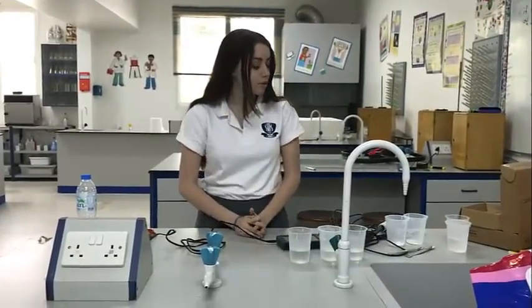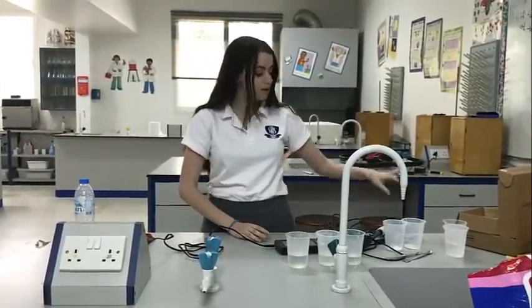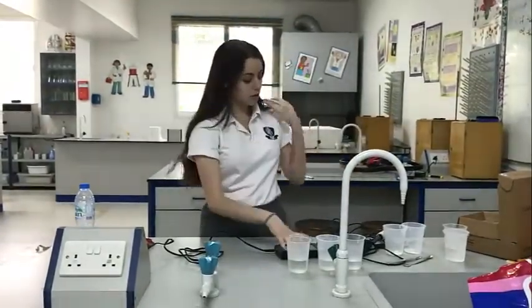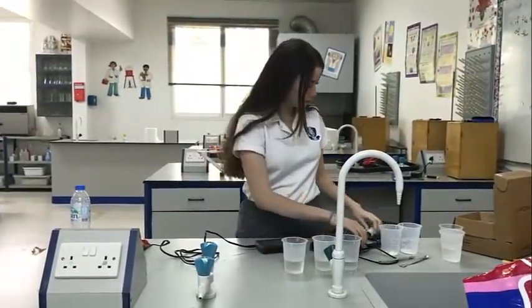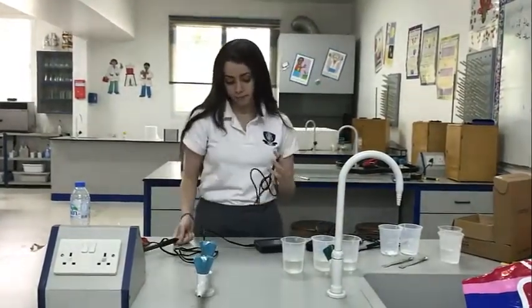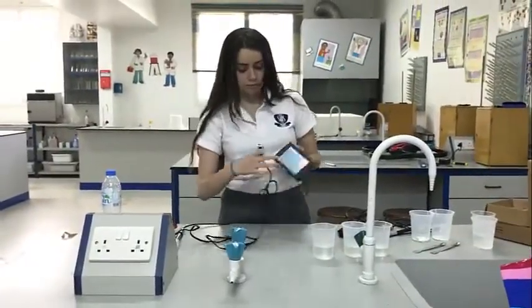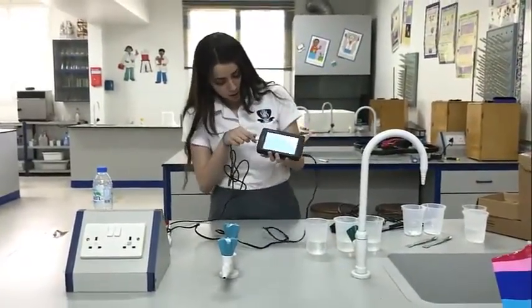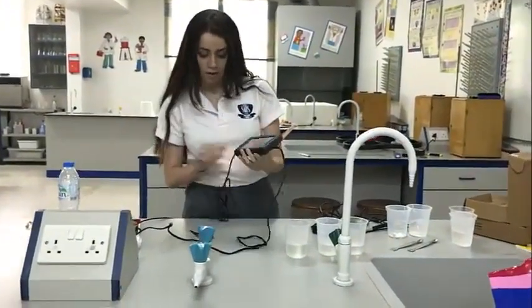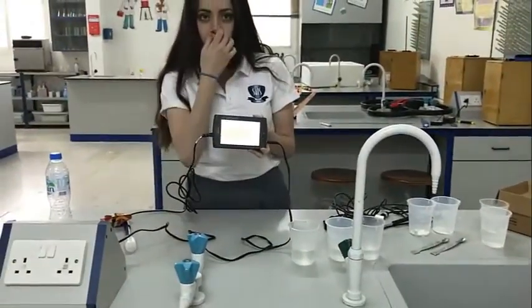And today I'm going to be showing you how to use the pH sensor, conductivity sensor, and the temperature sensor in 3 different experiments. First we're going to start with the pH sensor, and it's here. Connect it to the device. And automatically it's going to show the readings.